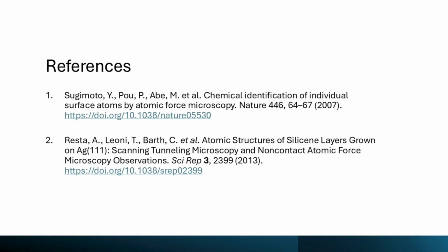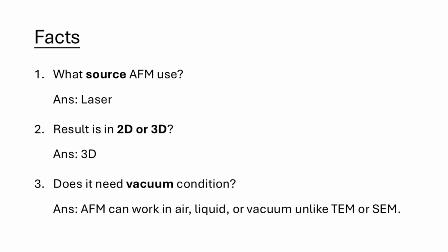So this is the reference for paper 1 and paper 2. So what is the source used by AFM? It is laser. And second, is the result 2D or 3D? The answer is 3D. And does it need vacuum condition? AFM can work in air, liquid, or vacuum, unlike TEM or SEM.